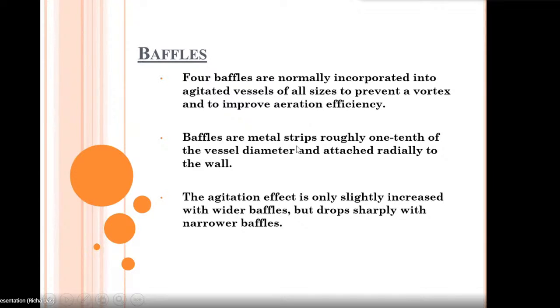And as I said, baffles are metal strips. They have to be 1/10 of the vessel diameter, because if they are not, the baffles will start colliding with the blades of the impeller, and both will hinder each other's activity. It is said that when the baffles are wider, the mixing is increased. But when narrow baffles are used, the agitation and mixing done by the baffles will decrease. So that is why it is advised to fit wider baffles.